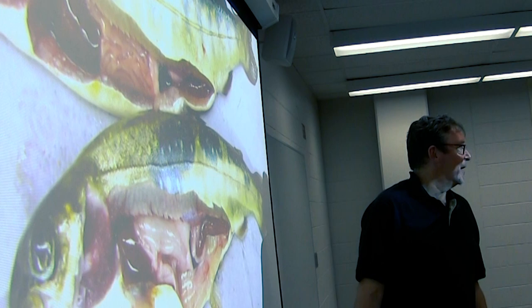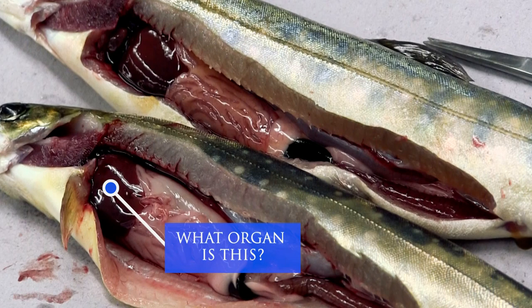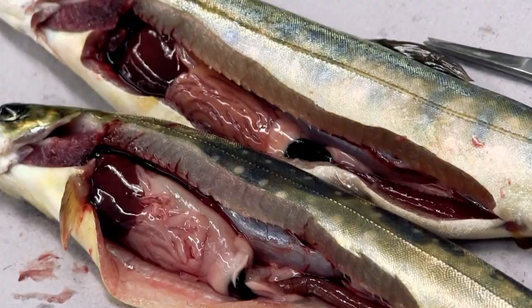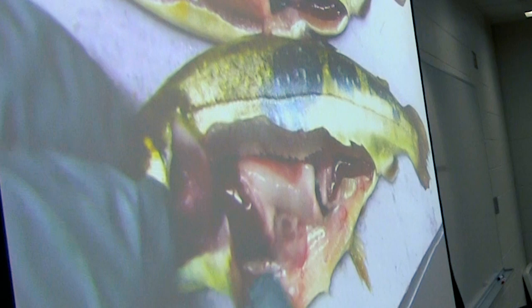We have our chart here. First of all, let's start — what organ are we looking at? The liver, okay. How about this?